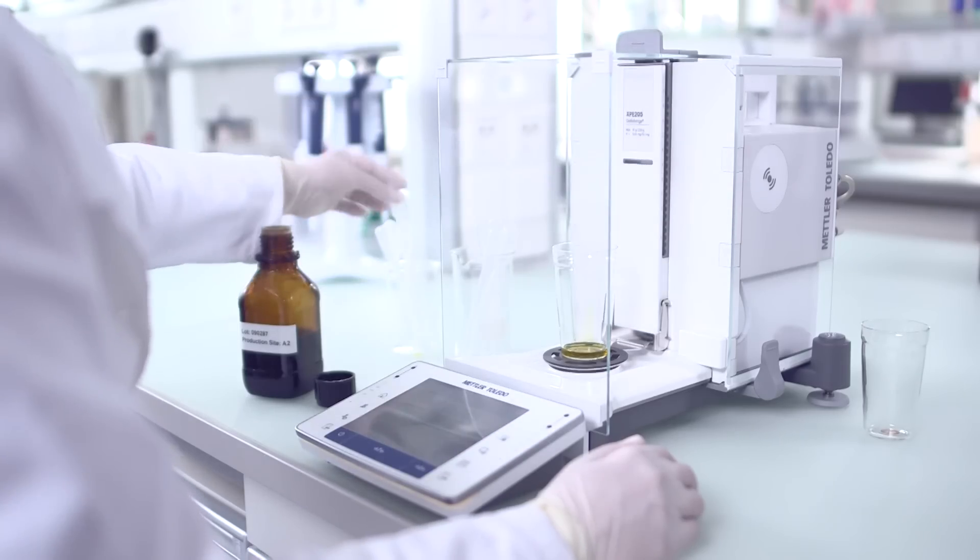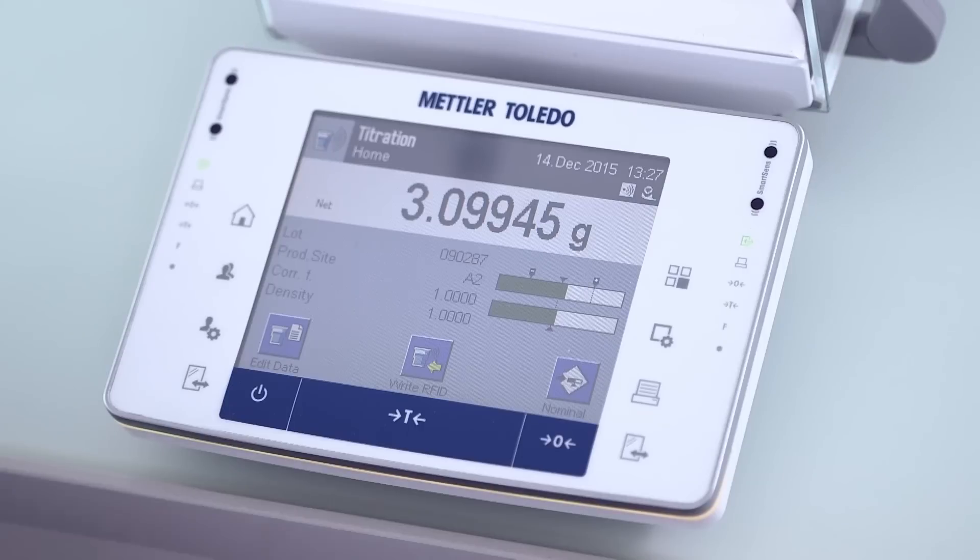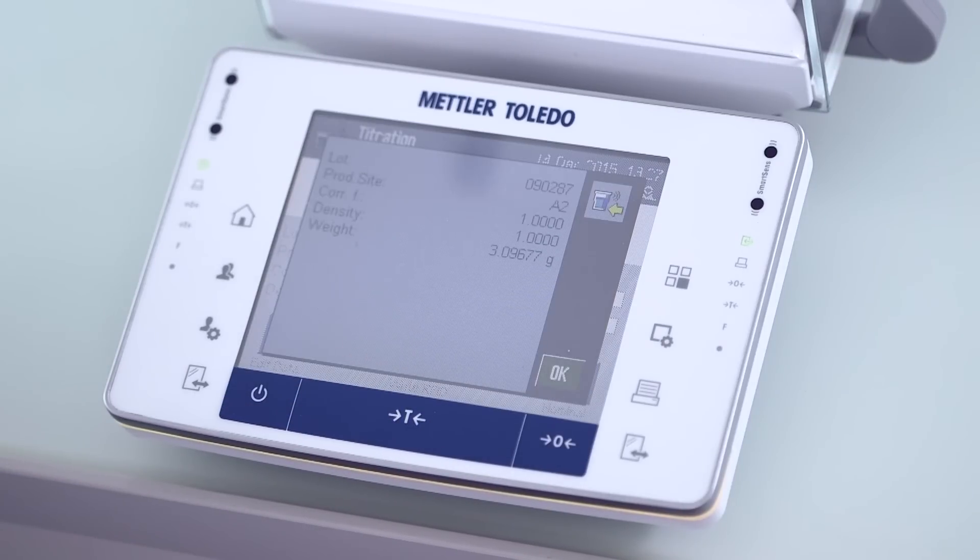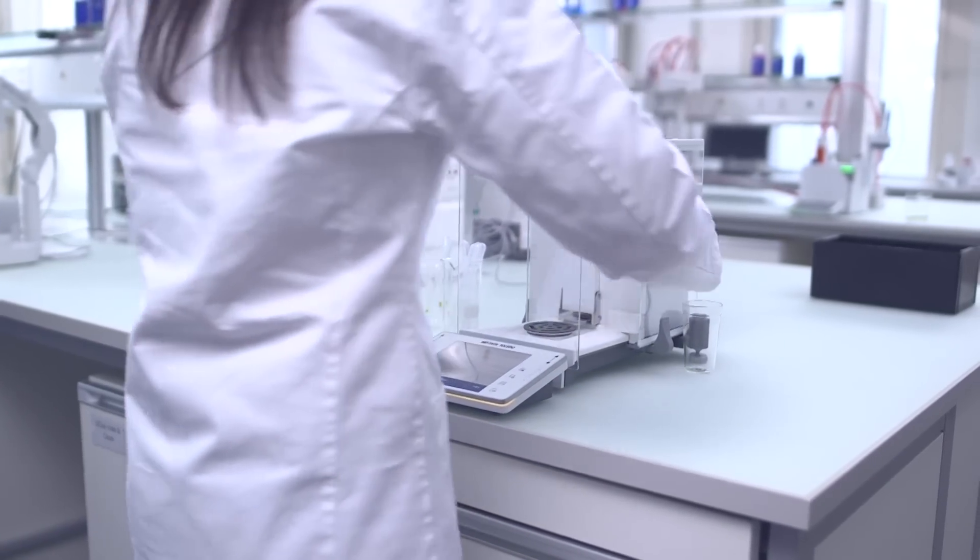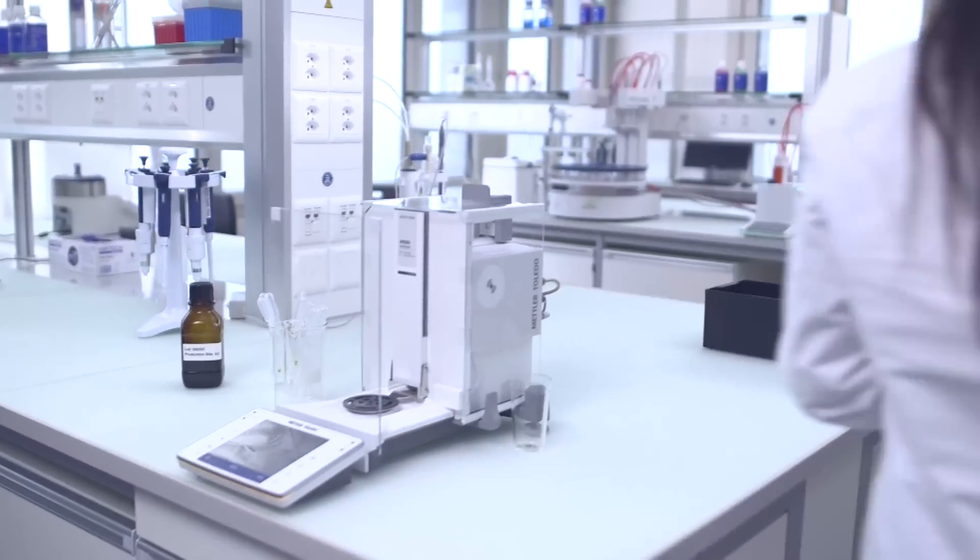At the balance, the sample data and weight are saved onto the RFID chip attached to the sample beaker. Together with the sample, the data is transferred to the excellence titrator, where it is read and saved.